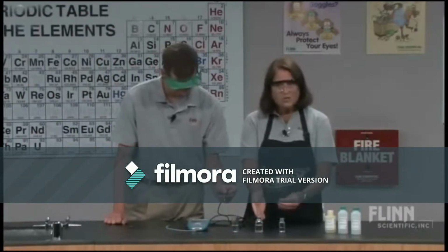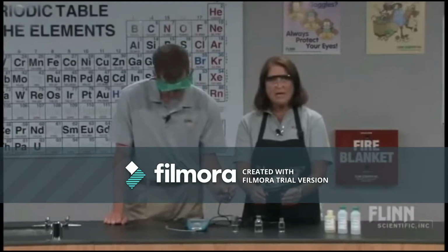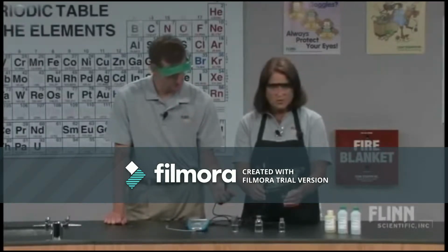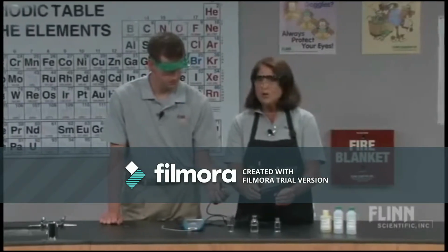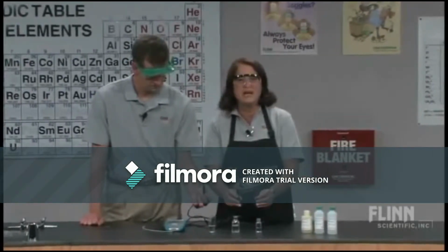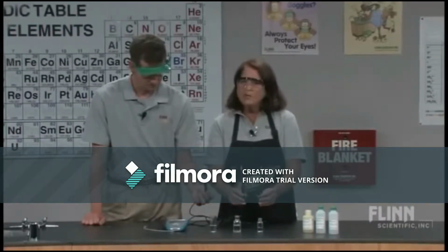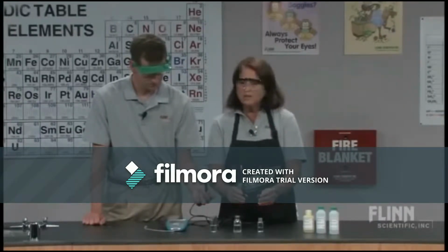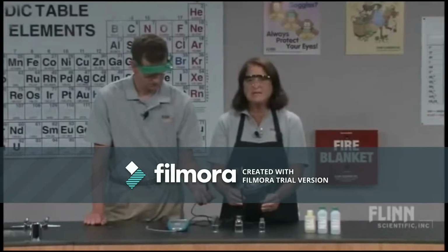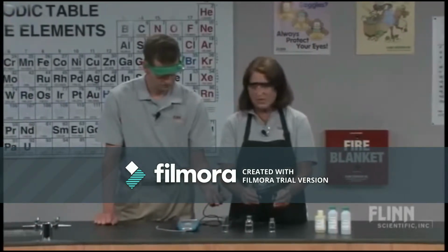We're going to dip them into the alcohols just to wet the tip of the probes and have the paper towel soaked. We're going to pull the probes out all at the same time, and then we're going to put the probes down. I don't want my students holding the probes. And wherever we put the probes, all 3 of them have to be in a similar location, a similar positioning.